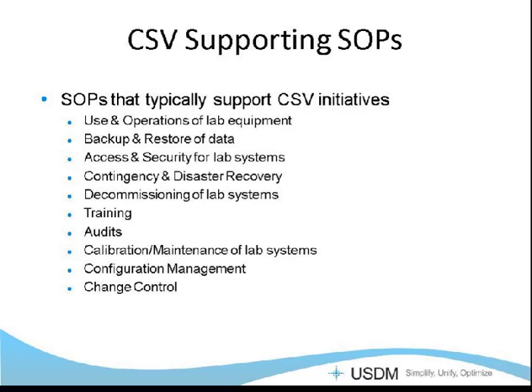Obviously, training SOPs, audit SOPs, there has to be periodic review of your validation data, just as there has to be periodic review of your internal SOPs. What's a good time period for that? When we say periodic review, you have to establish for your own lab what that periodicity is. Calibration and maintenance of lab systems, critical to have a program in place or software in place that helps you to control that. Again, that goes directly towards data integrity. Configuration management, how do we manage the changes to our system configuration that may occur over time? And overall change control, what do we do when we want to upgrade a software package or change out an HPLC pump?